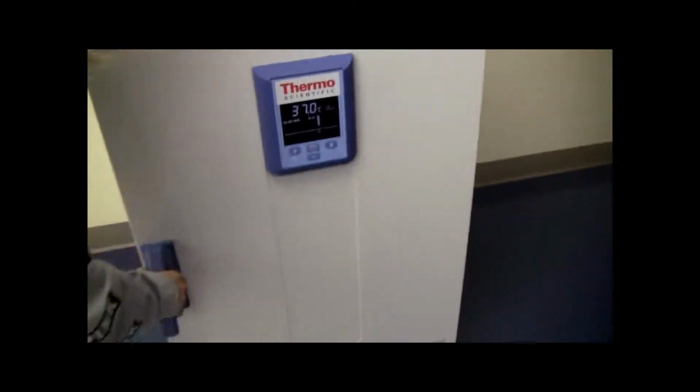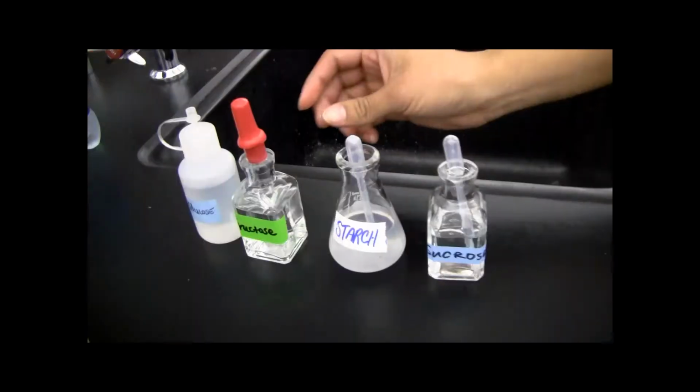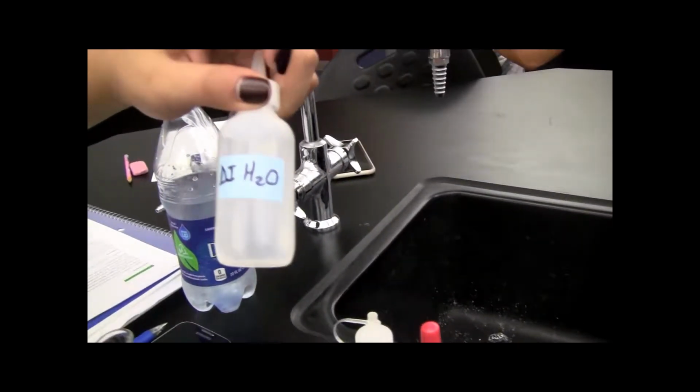Test tube rack. Fresh yeast suspended and warm. Glucose, fructose, starch, and sucrose. And what is that? Wax pencils. It's some sort of water. Is that the black one? Wax pencil.